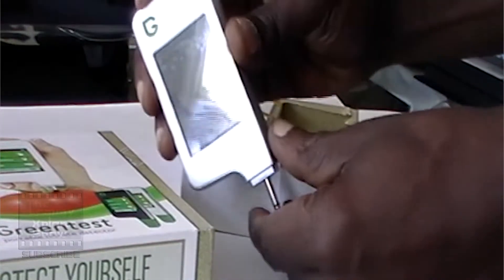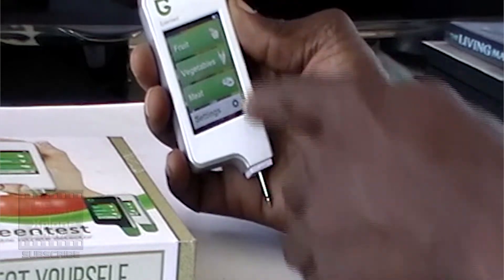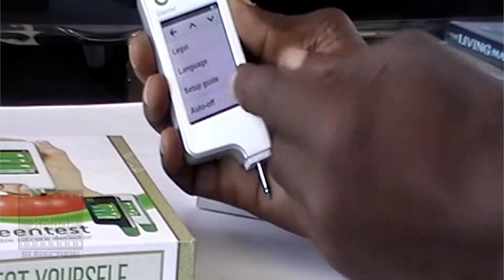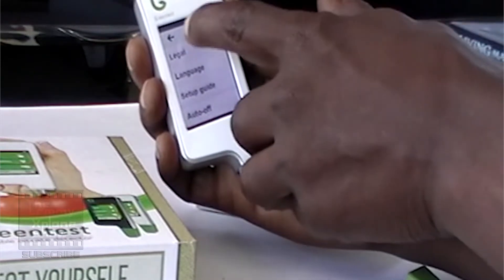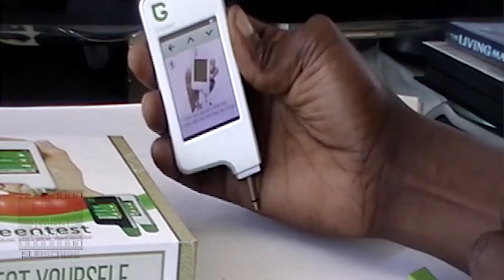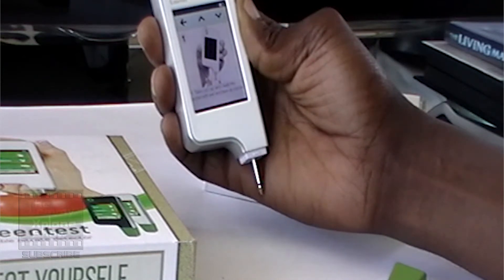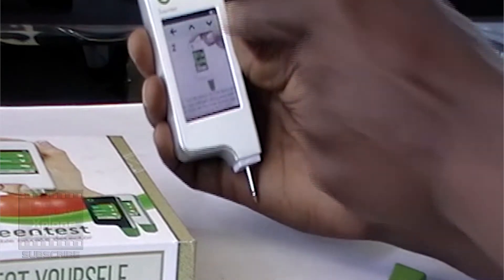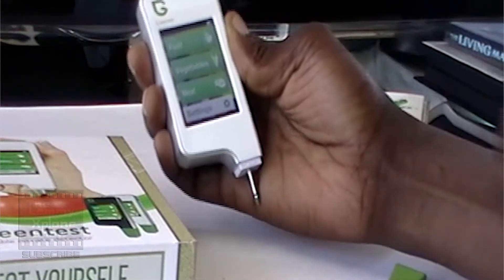Once powered on, you can select what you want to test — fruit, veggies, meat. These are all settings. The touchscreen is not really that responsive, but for 130 bucks, what do you expect? There's a legal terms section, a setup guide, and so on. The setup guide basically shows you how to take off the cap and clean the probe with wet and dry tissue so that you get an accurate reading. Pretty straightforward — you power it up and get into it.